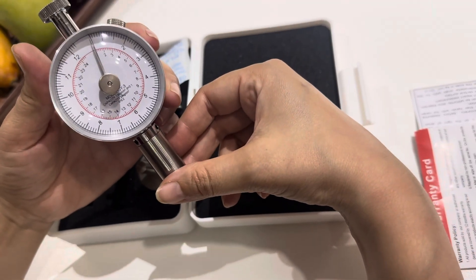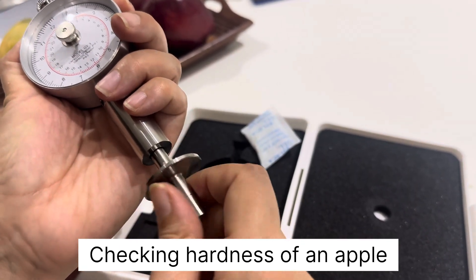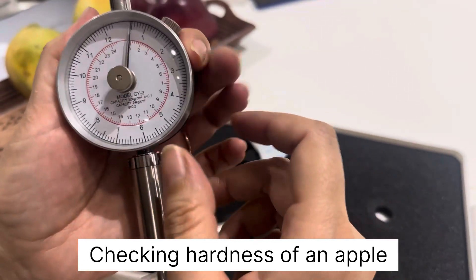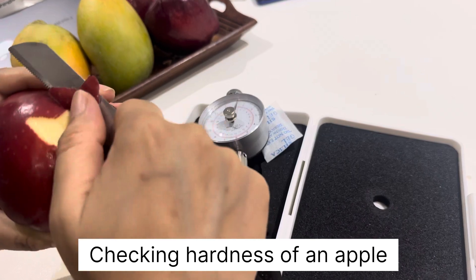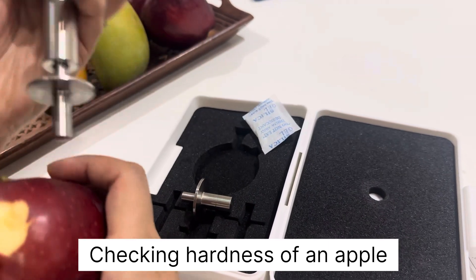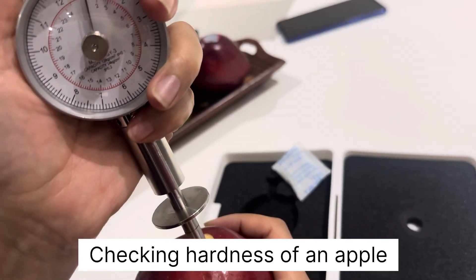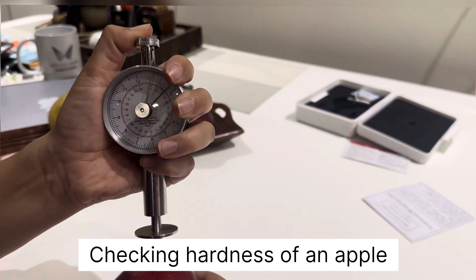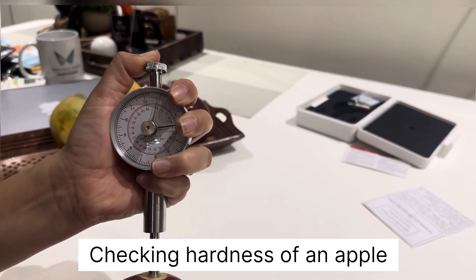For the GY3, the alignment is at 0.5. Let's test the hardness of an apple. After aligning the scale at 0.5, we will use the 8 mm pressure head. We peel off approximately one centimeter square of the apple, then keep the fruit hardness tester vertically and slowly apply pressure. The pointer starts rotating — press the head up to 10 mm and then stop.